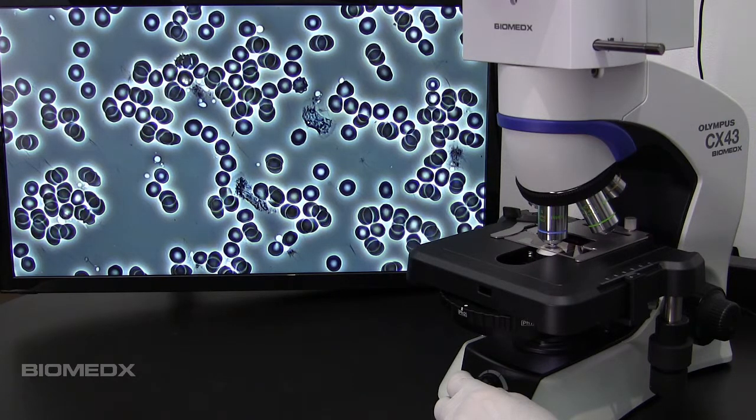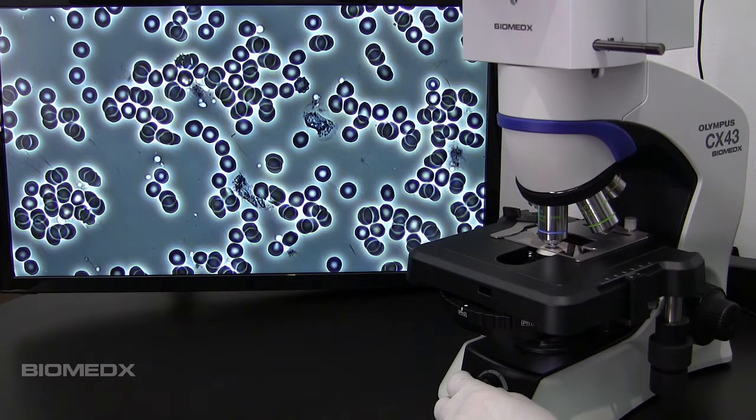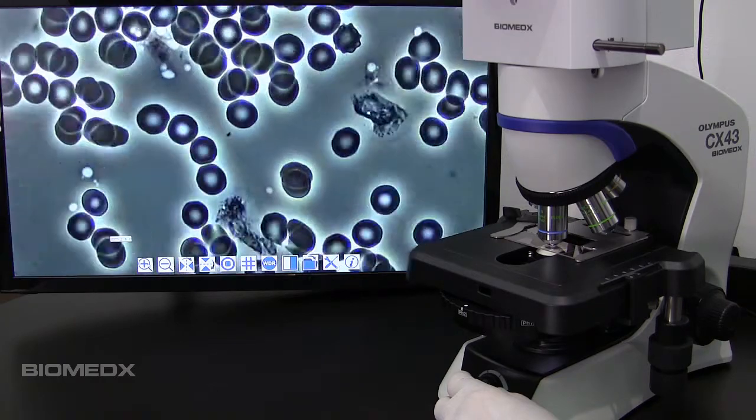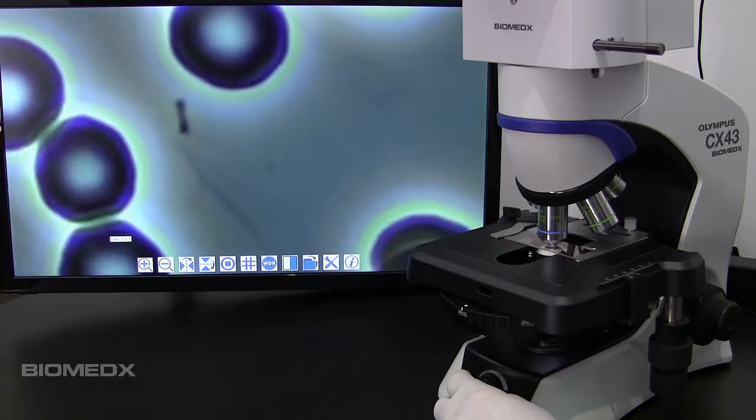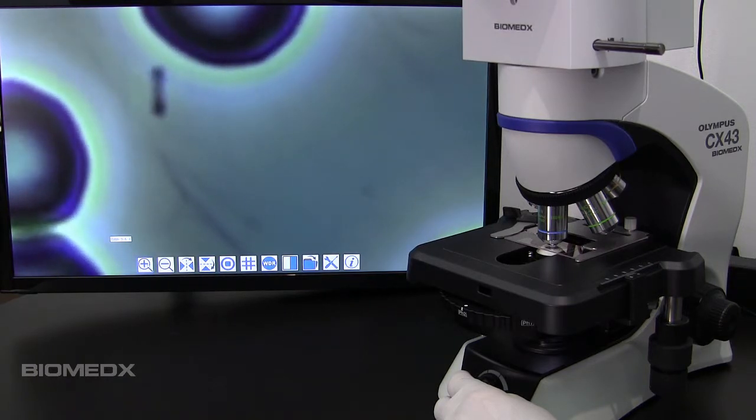Right now we are in phase contrast and I am putting the mouse pointer to the center of the screen to point to a little bugger. And we are going to zoom in on that. Here is the zoom. All digital. Looks like a little microbial form like a bacteria, an EV, extracellular vesicle.